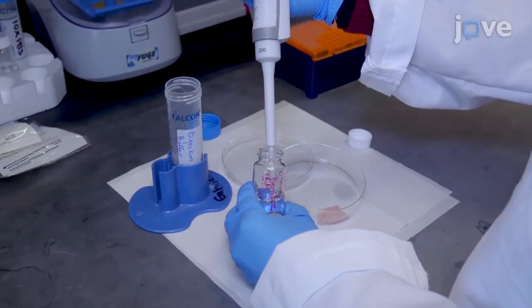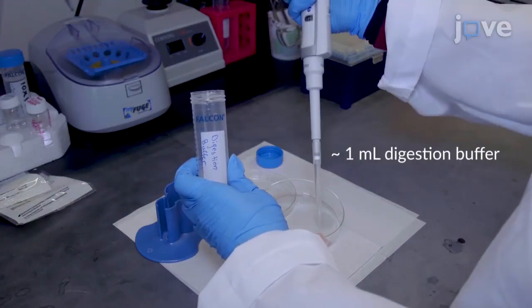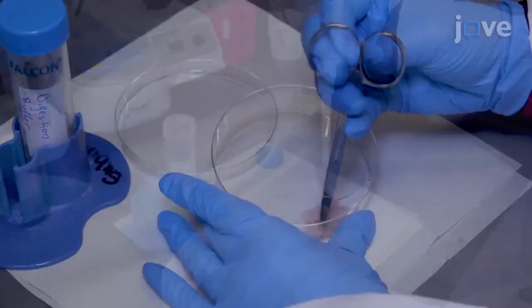Add calcium chloride to the digestion buffer to a final concentration of 10 millimolar. Then add a small volume of the buffer to the tissue and thoroughly mince it.